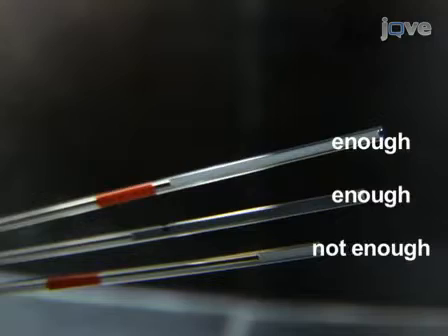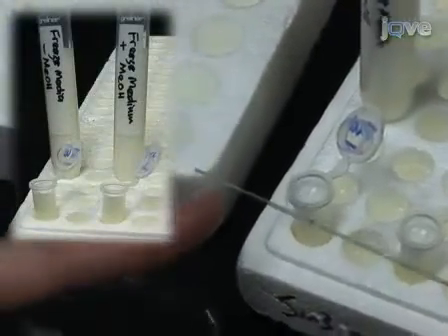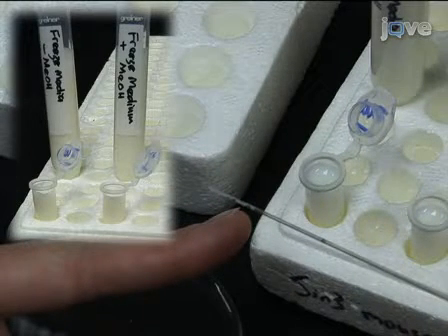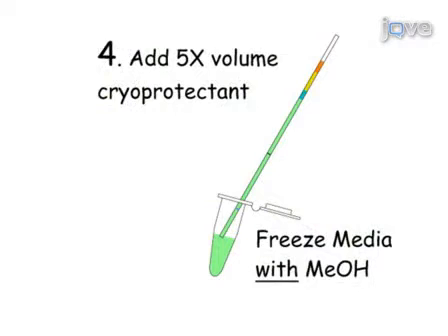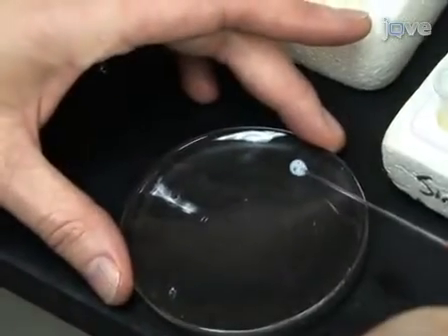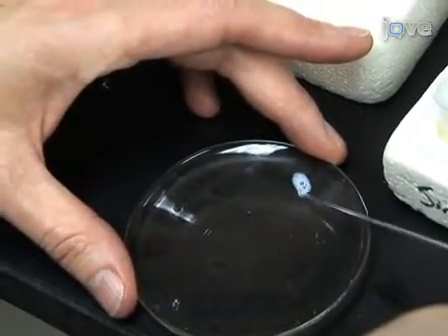If sperm volume does not reach the target volume of 3.3 microliters, then it is necessary to normalize the volume to the pen mark using freeze medium without methanol. If the volume of sperm already reaches or exceeds the pen mark on the capillary tube, then proceed to the next step. Now add the cryoprotectant to the sperm. Suck up freezing medium with methanol to the orange mark. The approximate total volume is now 20 microliters. Expel the sperm and cryoprotectant mixture onto a clean area of a watch glass, gently mix by pipetting up and down about four times and avoid introducing bubbles.